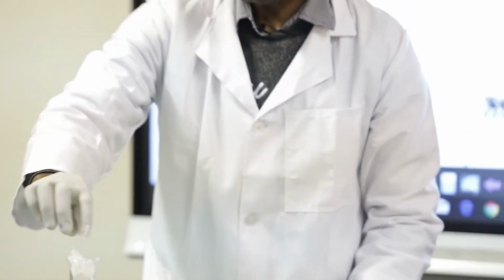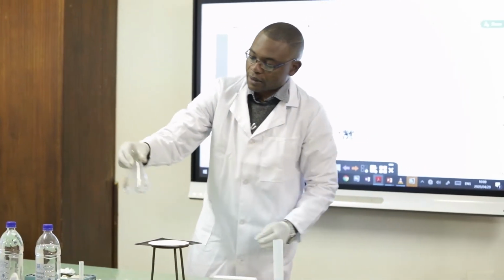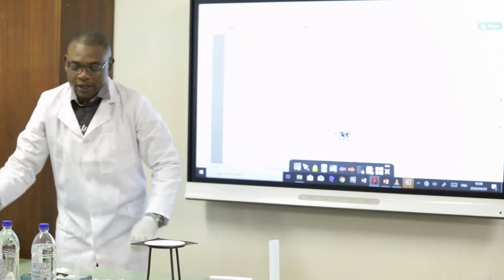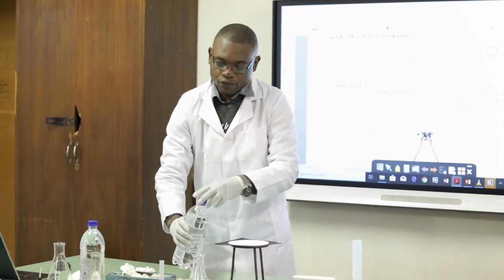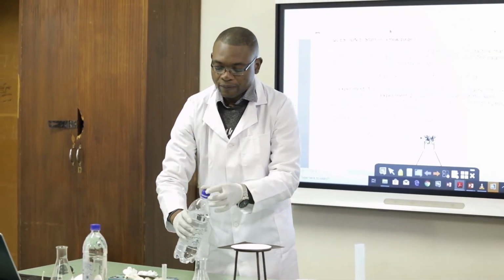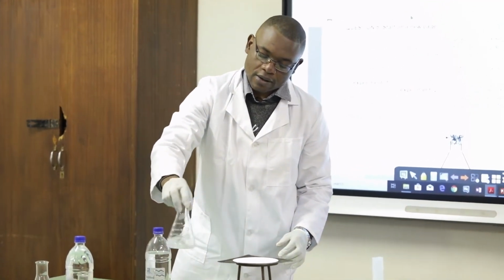Okay. So I'm going to throw away this solution, and I'm going to rinse my flask.